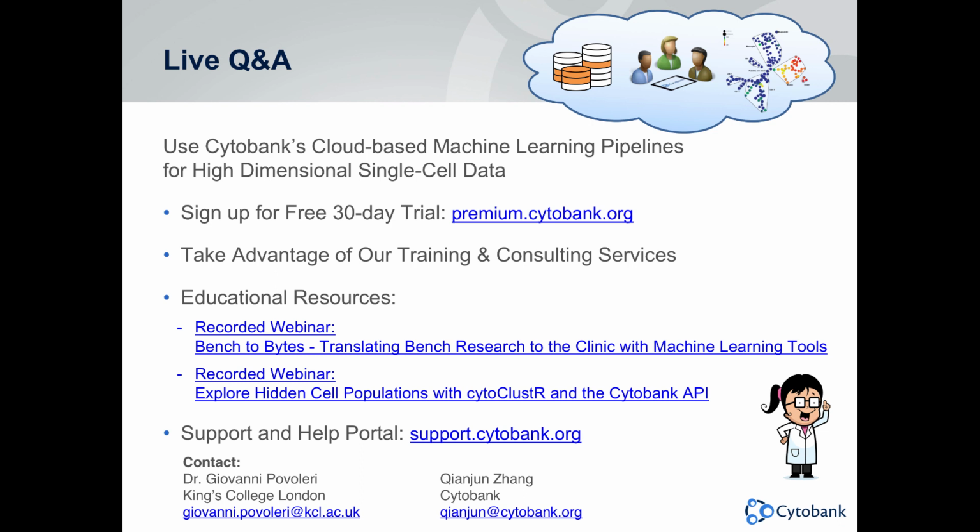Thanks. We have a second question coming here. It says, how did you acquire the CyTOF data? Was all the data collected in one day or over multiple days? How do you account for differences in day-to-day variation when running t-SNE on Cytobank? This is Shahram Kordasti.